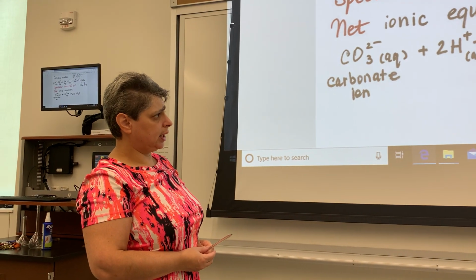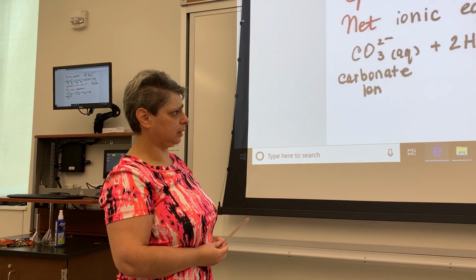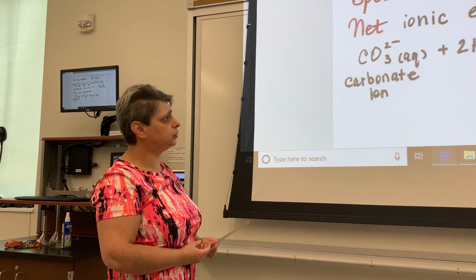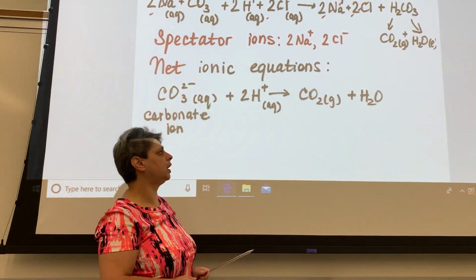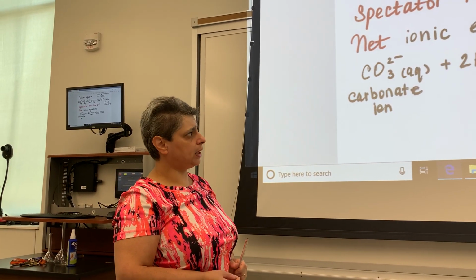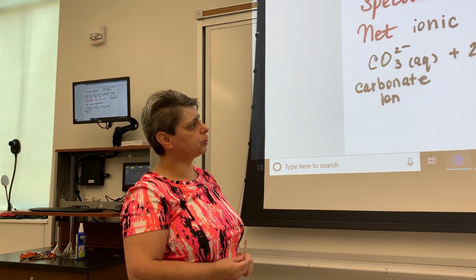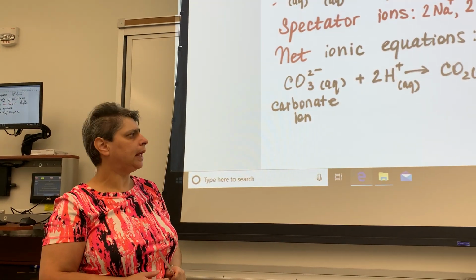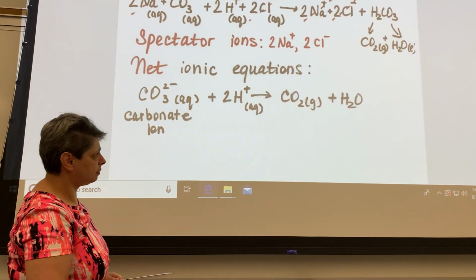I would like to point out that in this lab, the concentrations of reagents are higher than what's recommended in your lab manual, and this is by design. That's something I asked our stockroom to do to make it easier for you to detect the bubbles. But remember, it won't be nearly as spectacular as if you open a warm can of pop. It won't foam like this, and bubbles should be looked for immediately after combining the reagents because they'll escape quickly. So make sure you look closely when trying to detect carbon dioxide.